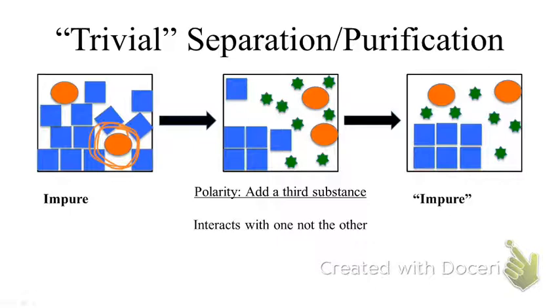So our salt particle is that orange circle, and sand is the blue squares. How does water get that salt molecule out of that structure? With the water dissolving the salt? Good call. Water would need to dissolve the salt. Except, where's the salt? Inside the sand.